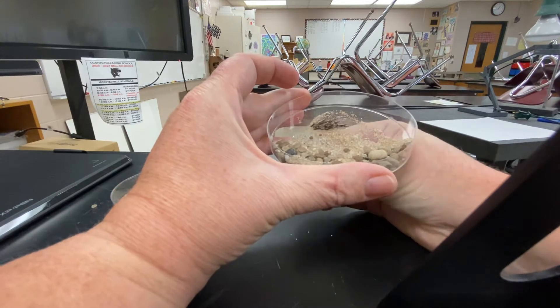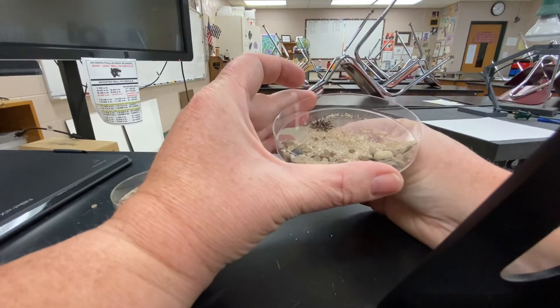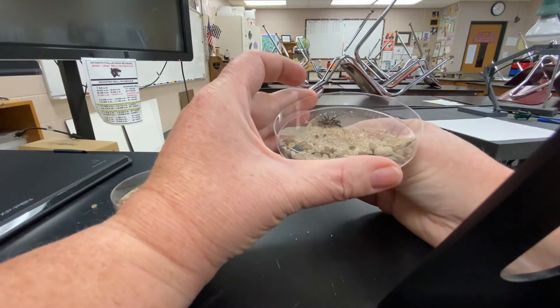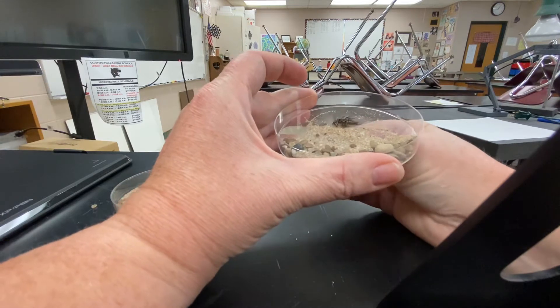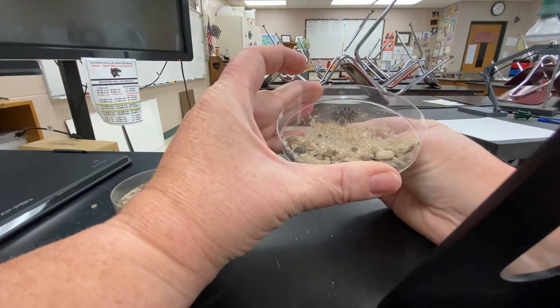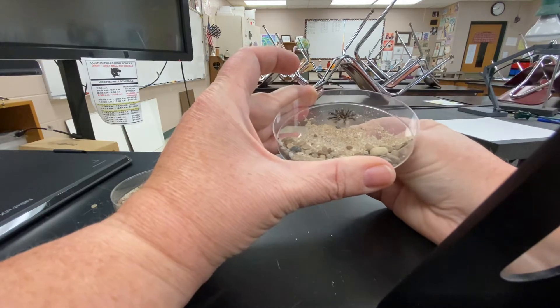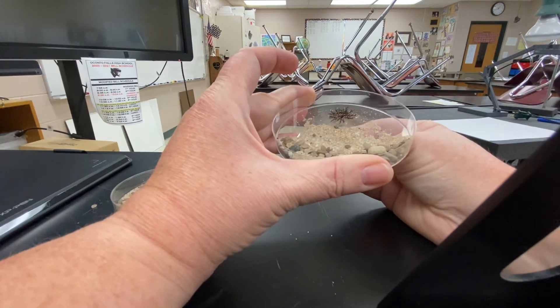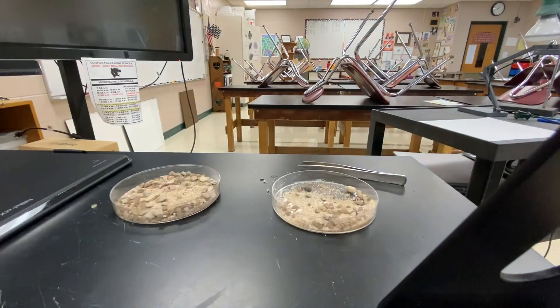There is indeed a magnetic component to this mixture. While I go through the rest of the demonstrations, I'd like you to think about what that substance might be — I'll give you a reveal at the end. I have identified one substance and I think I have a good idea of how I can remove it from this mixture.